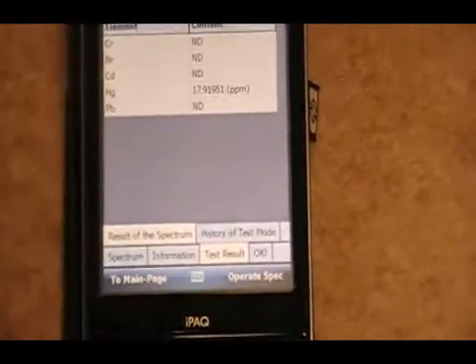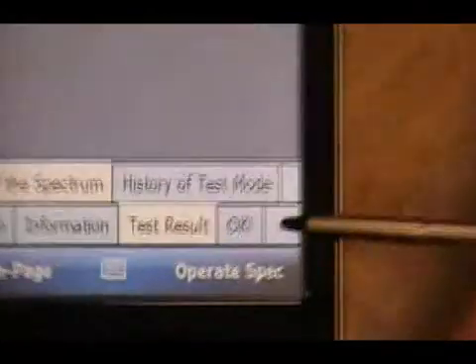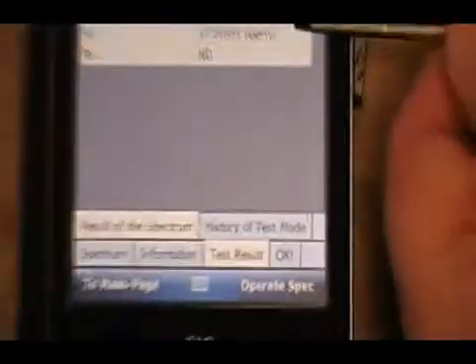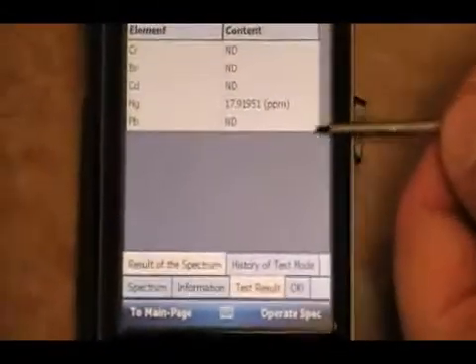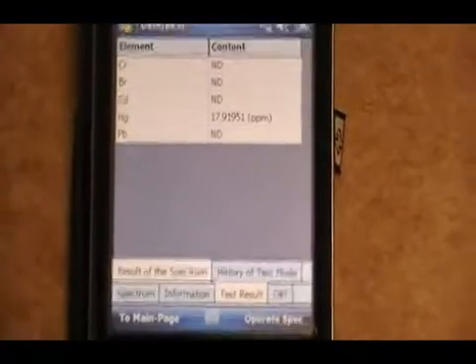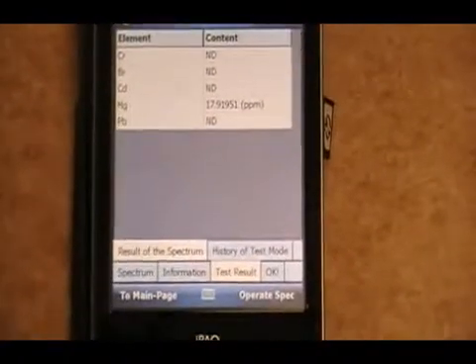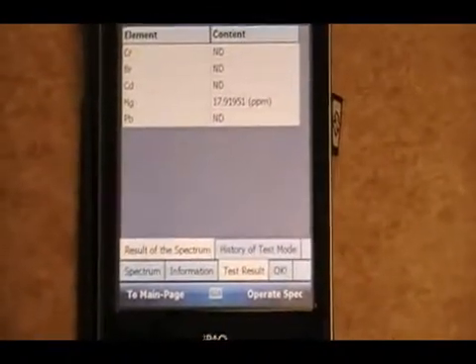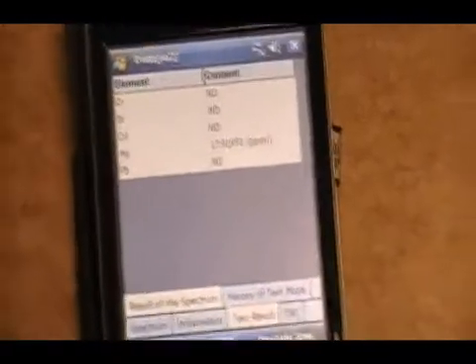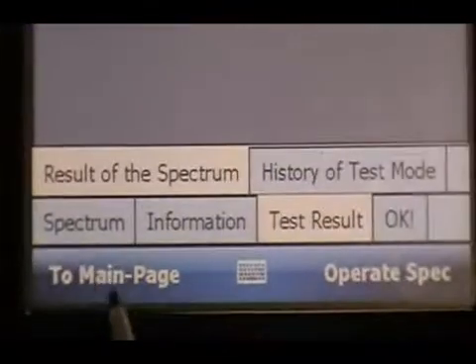OK. It says OK here where it counted out. That means the program's done. The only thing that showed up as a hit was mercury. And please realize, anything under 20 ppm really isn't there anyways. We're going to go back to the main page.